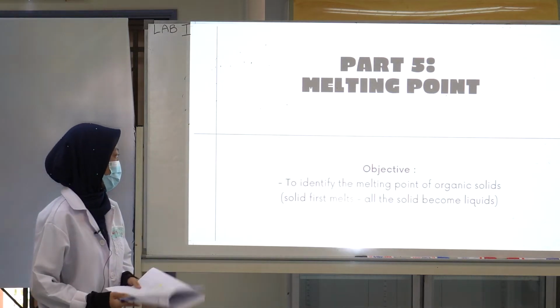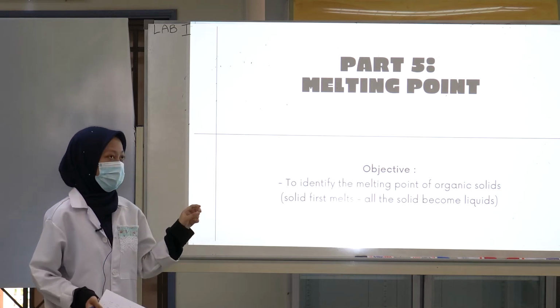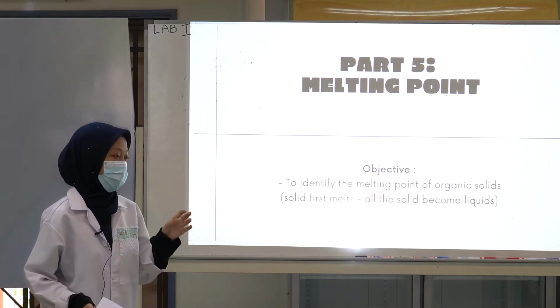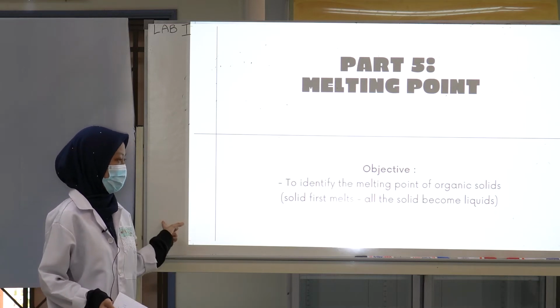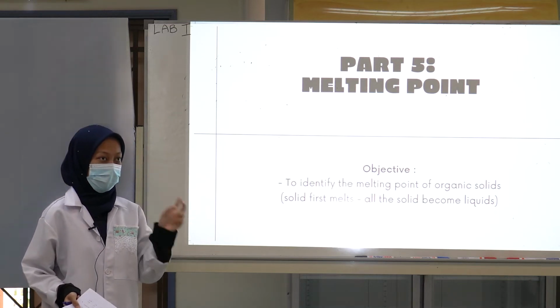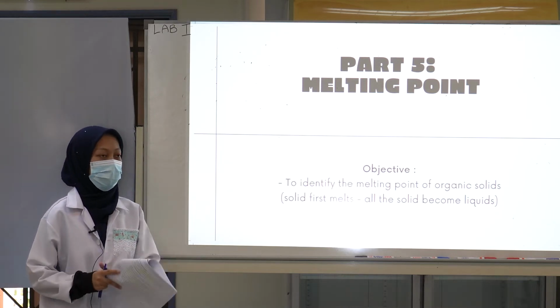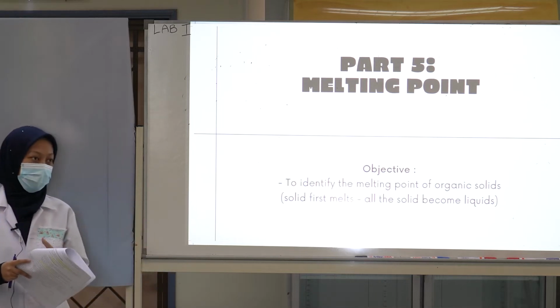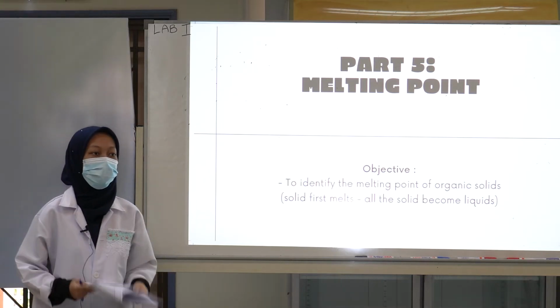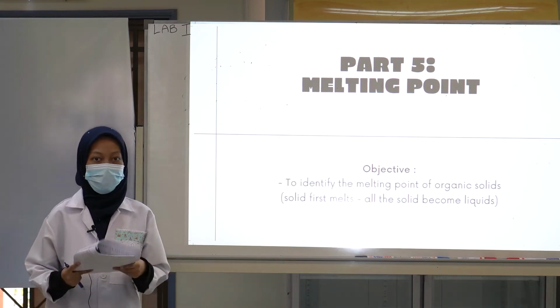Next part is melting point. The objective for this melting point is that we need to identify the melting point of an organic solid. So melting point here is when we see the organic solid first melts until all the organic solid becomes liquid, which is completely melted.